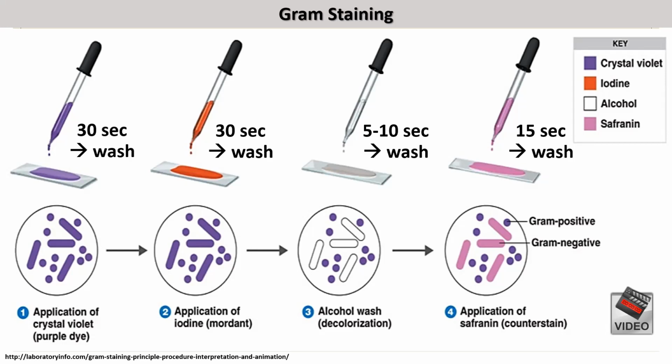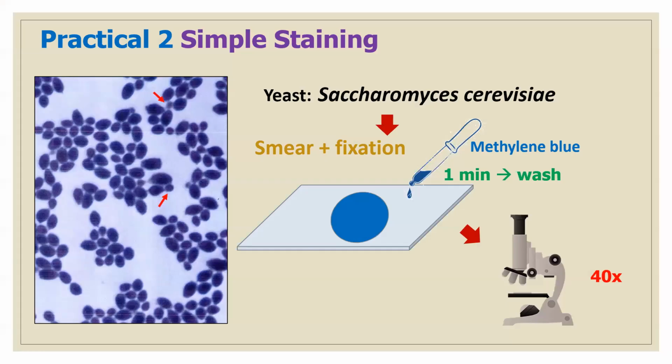As you can see from this diagram, in each step, it will show the different staining of the bacteria according to the cell component. And again, I would like to encourage you to watch the video before performing this practical.